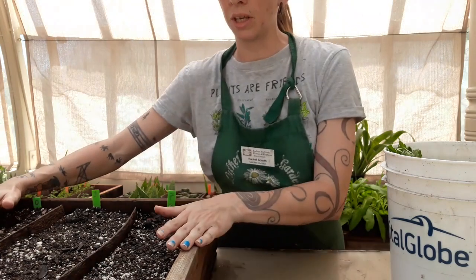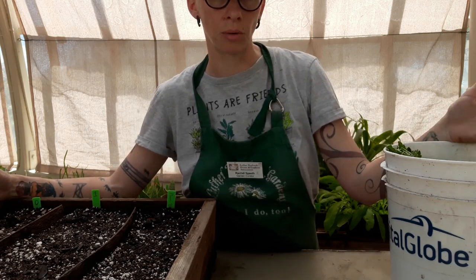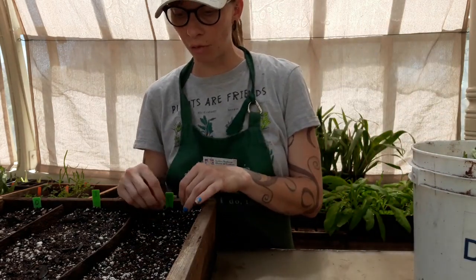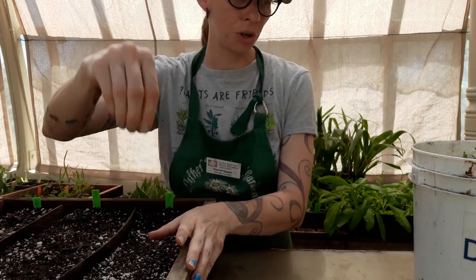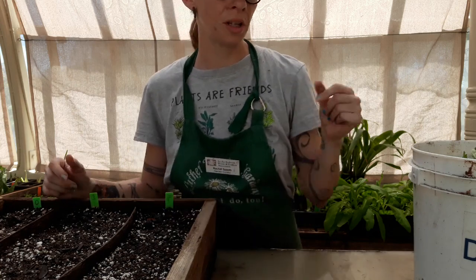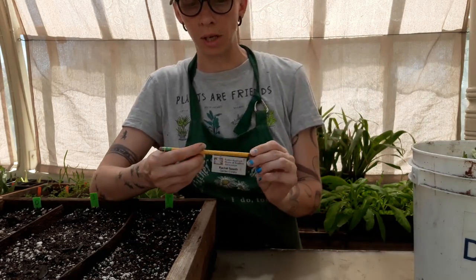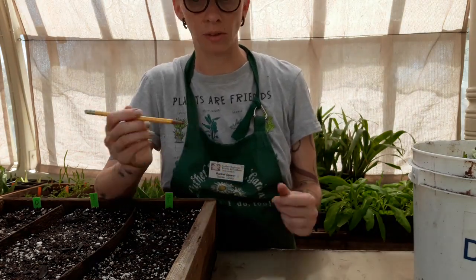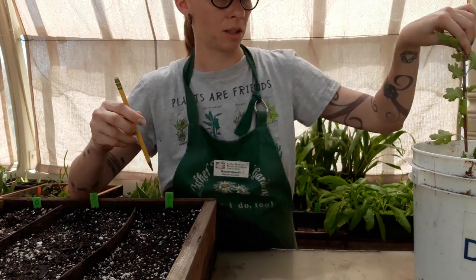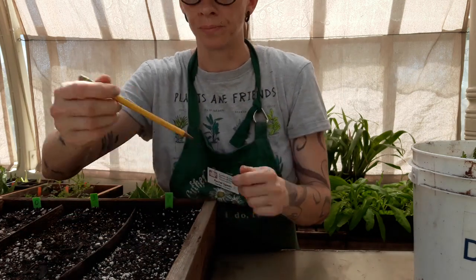You want to make sure your soil media is moist first, because as soon as we cut these things they're already losing moisture and they don't have any roots to suck up more. Also, if you have moist soil and you push your cuttings in directly, you'll end up wiping off the rooting hormone. So it's best to pre-drill these holes. I'm going to use this pencil because it's a little bit bigger than the diameter of my chrysanthemum stem.